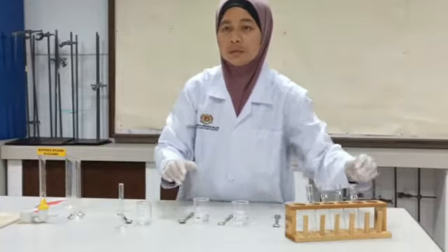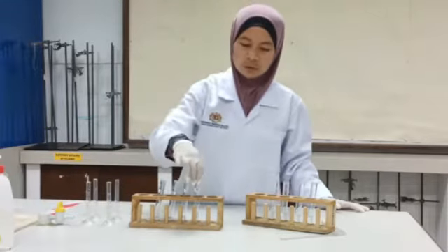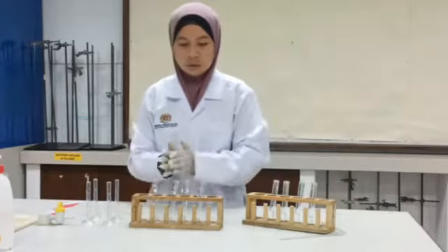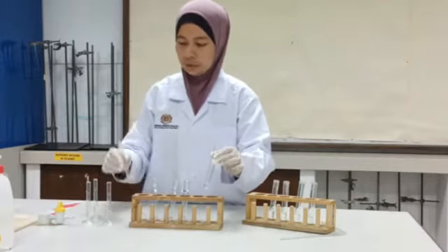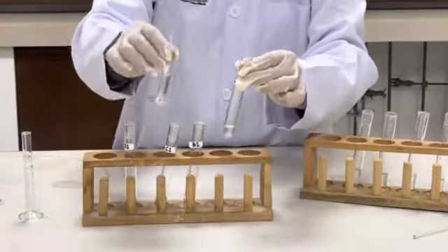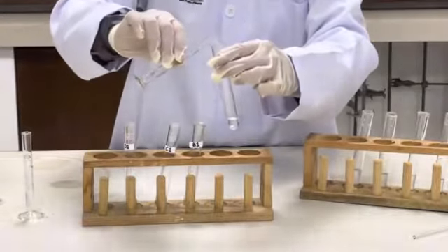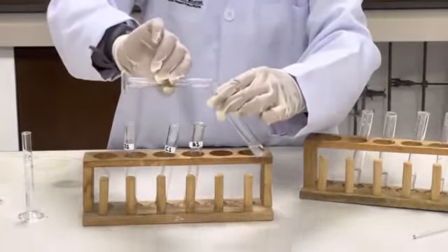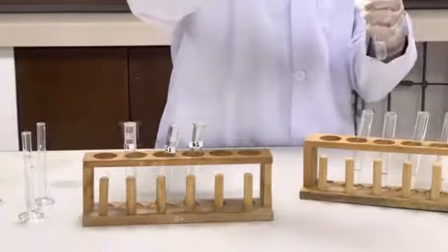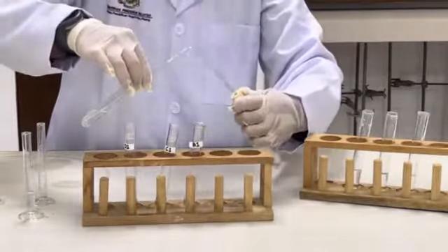First, we will do the test for carbonate ion for each of salt A, salt B, salt C, and salt D. We pour 2 cm³ of 2.0 mole dm³ hydrochloric acid. If effervescence occurs, we need to flow the gas into lime water. Just pour it, and then immediately put it inside the lime water.